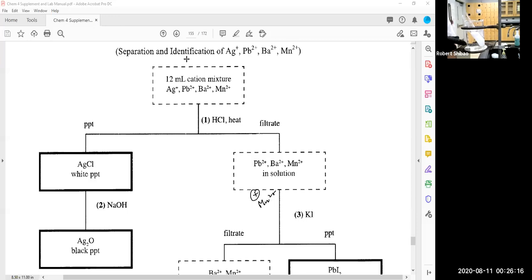This way, it can't exceed 100 degrees C, or roughly there. It depends on how pure the water is, but the water's max temperature is going to be about 100. The flame is 600 or maybe even closer to 900, depending. I don't think it's that hot, but the book says. And so I'm going to get the flame going here, and then start my hot water bath.